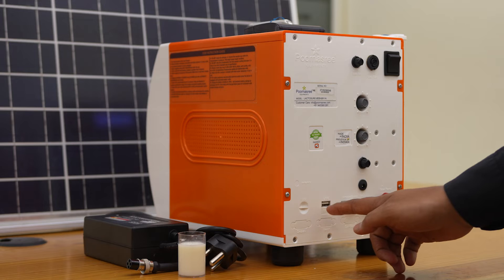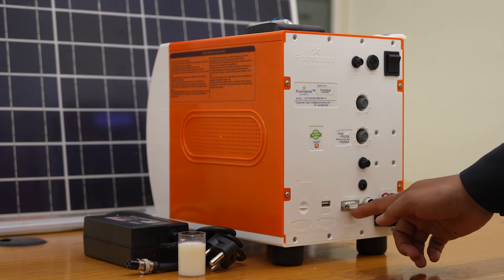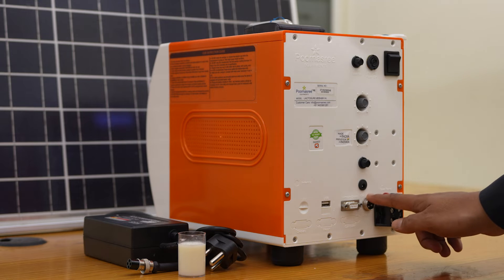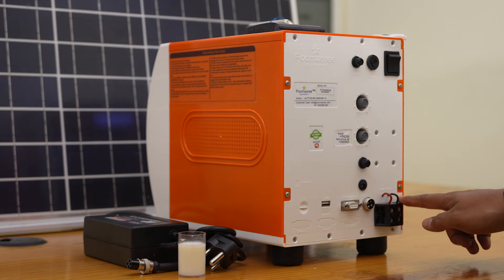The back panel also includes the DC input, USB port, computer connectivity RS-232 pin, a charger adapter connector, and a connector for the solar panel.